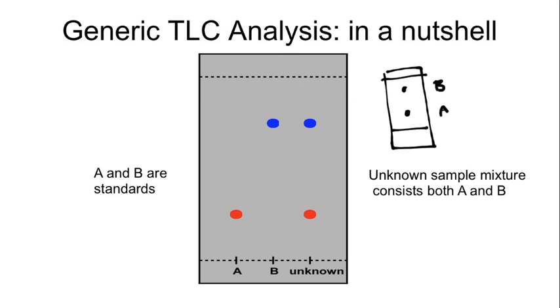Okay, you're right, we could change the polarity of the compound, but then we're evaluating a different compound, so that doesn't work. Our stationary phase stays the same regardless, so we can't change the stationary phase either. So yeah, that really only leaves our mobile phase. So what we can do is change our mobile phase.